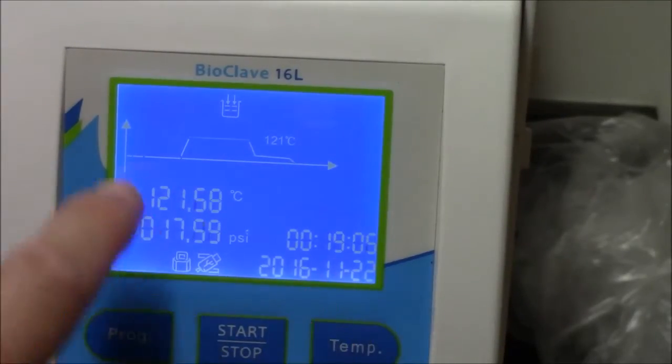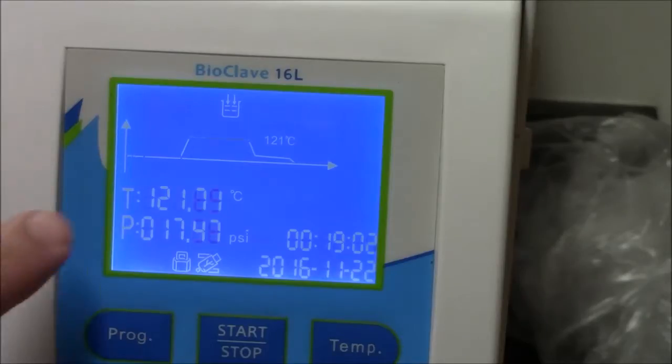About 19 minutes in. We're on the top plateau now keeping at 121 degrees Celsius. You can see that here.